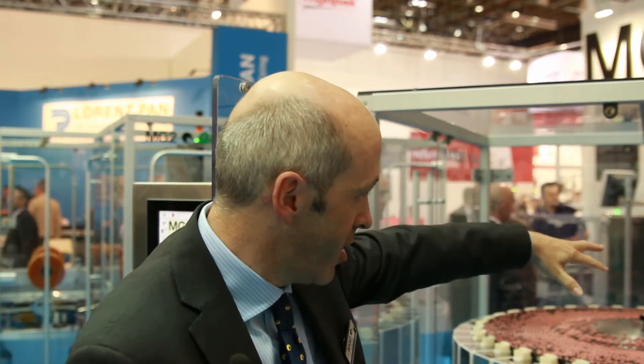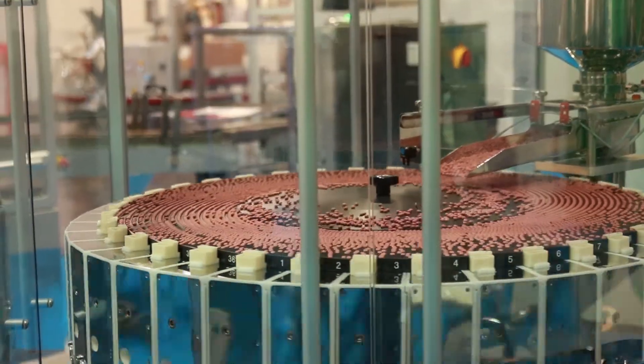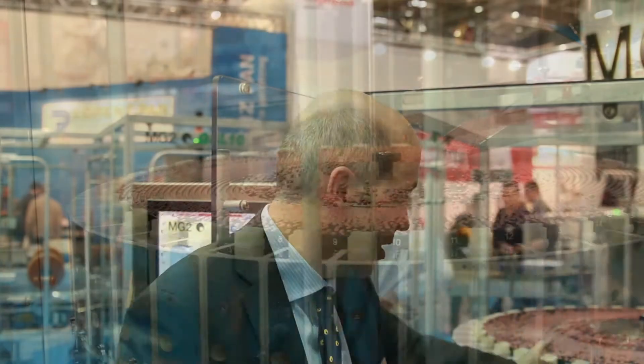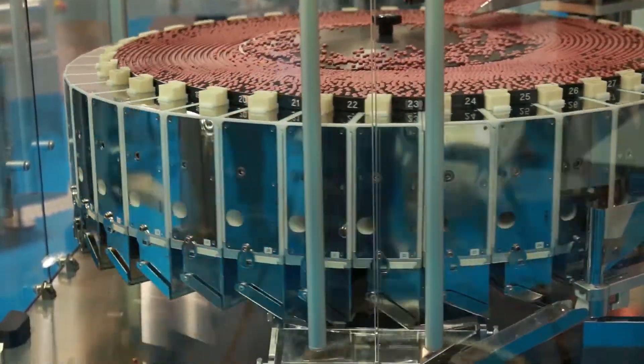The tablets are fed from the top with the hopper. They go into this big plate that is a vibrating and rotating plate and move all the tablets into these modules. We have 36 modules in the machine and each module works to check the weight of each single tablet.